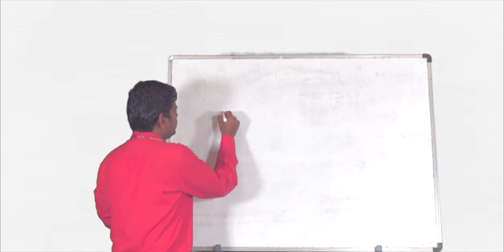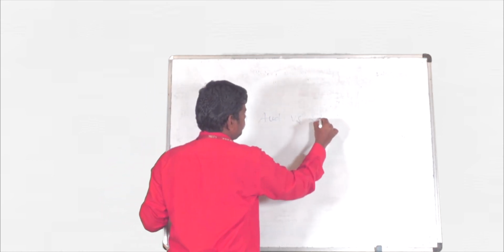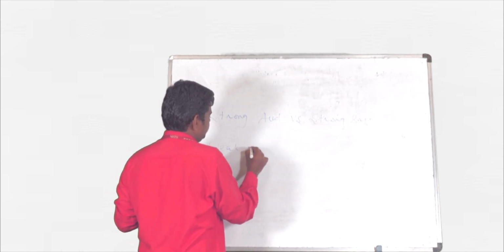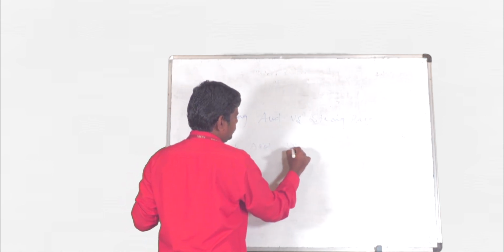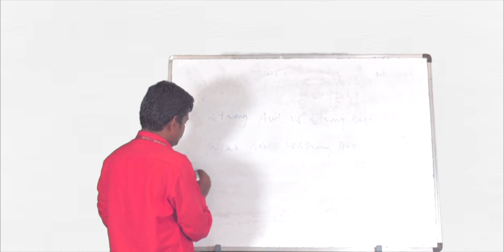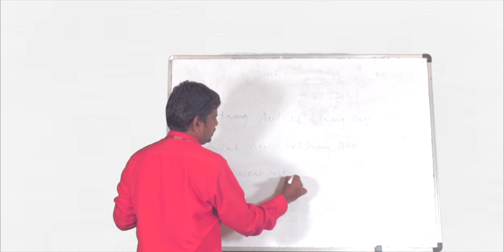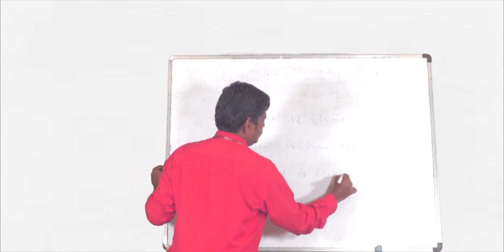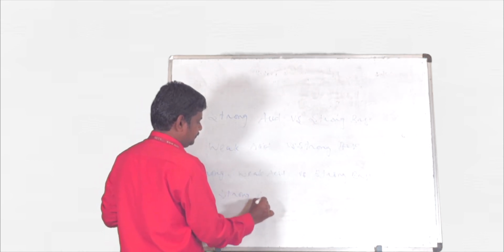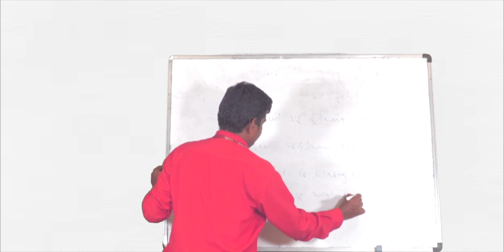We can deal with strong acid versus strong base, weak acid versus strong base, a combination of strong and weak acid versus strong base, strong acid versus weak base, and finally precipitation reactions.